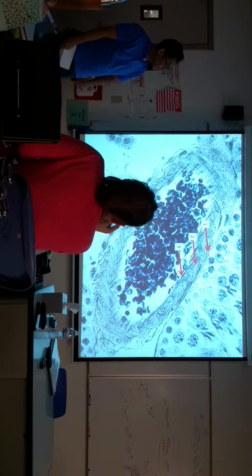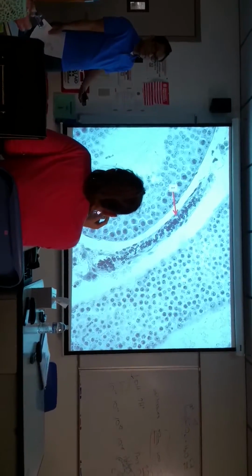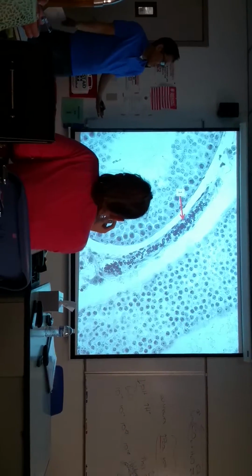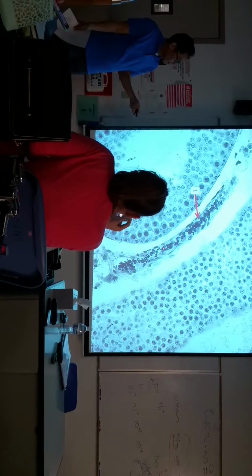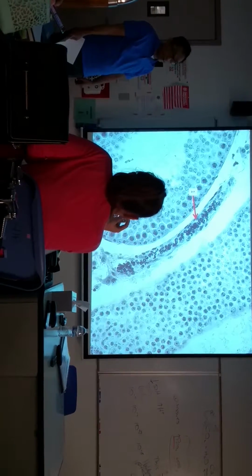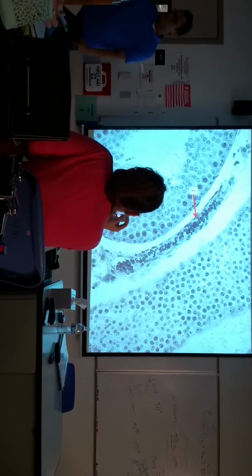Down to 1 layer. So which layer is it? Tunica intima. So I guess call this a capillary. They're almost single file there, which is why we can categorize it as a capillary. Very, very thin. That's also from the rat testis slide.